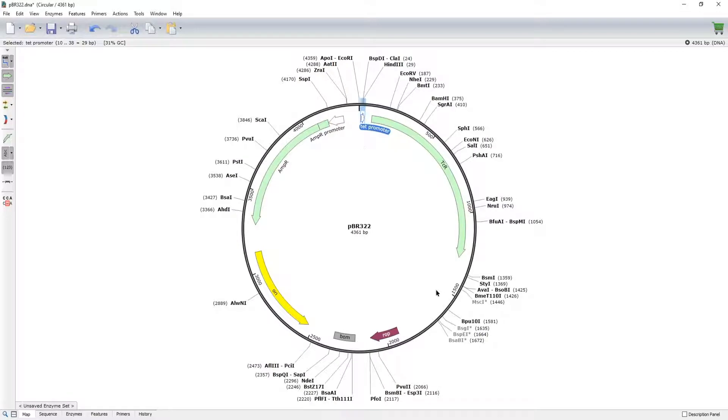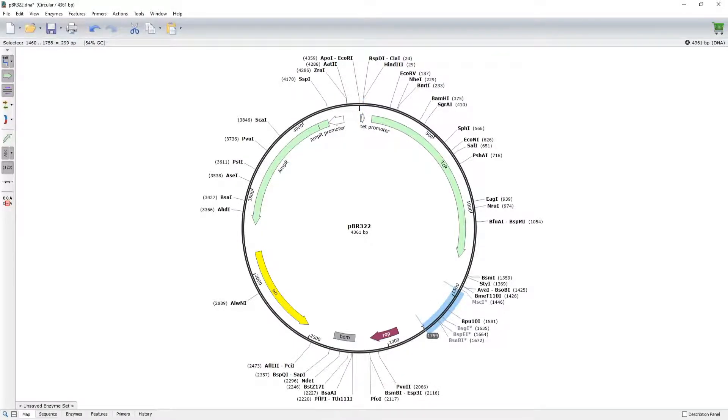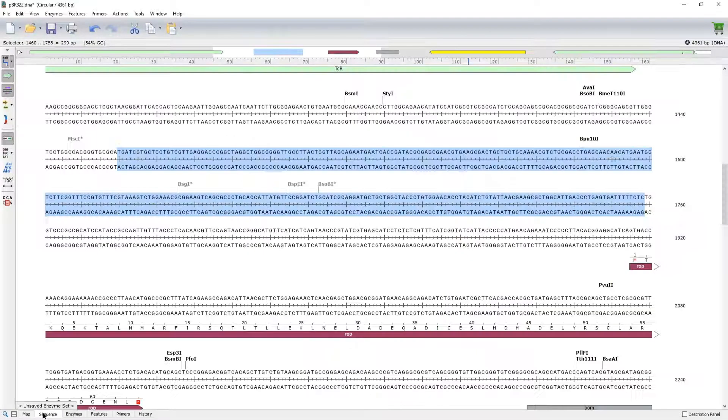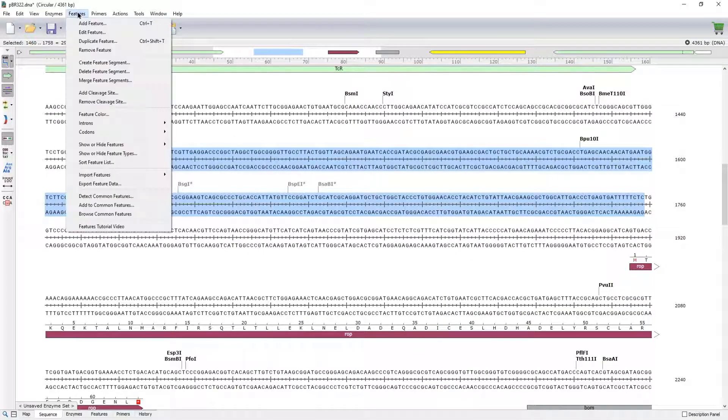You can also create new features by highlighting the relevant area on the plasmid map or the sequence view, and choosing Add Feature.